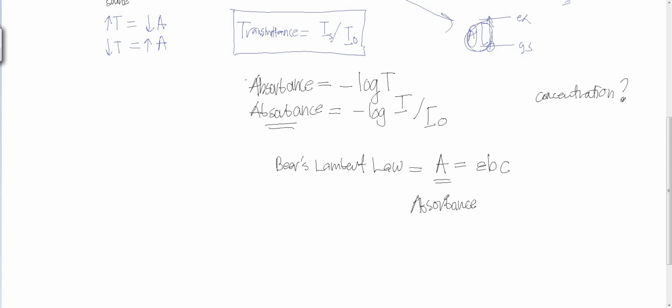Okay, so datang daripada mana absorbent? So you can get it from the transmittant by calculating I over I naught dan sebagainya. Okay, this is what we call the molar absorptivity, yang mana molar absorptivity usually constant. Okay, selalunya ada nilai yang tertentu based on the molecule, for example.